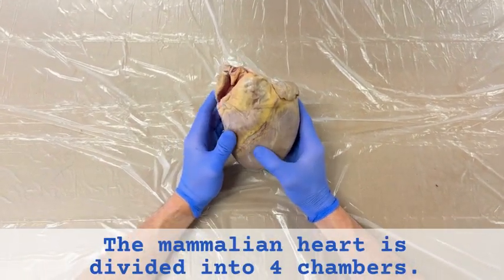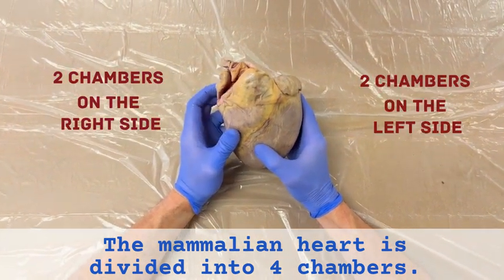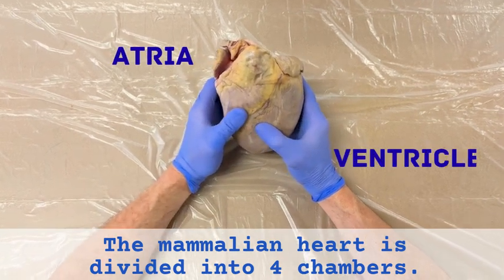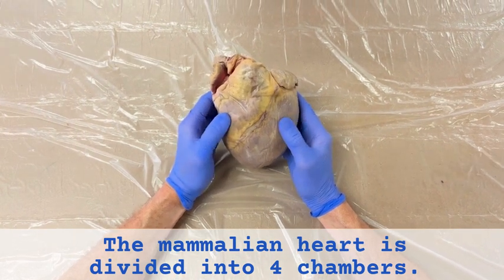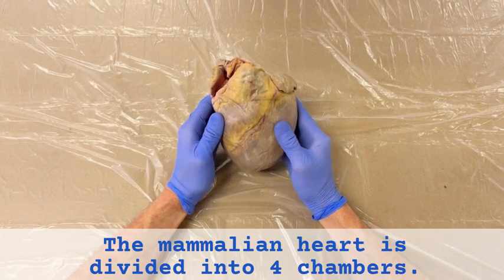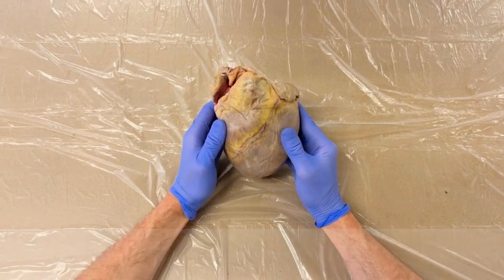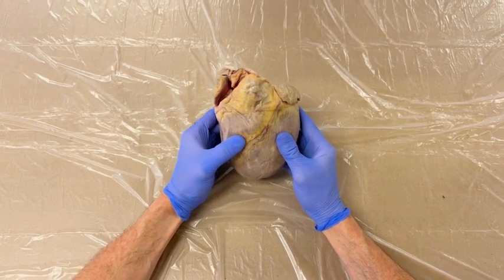The mammalian heart is divided into 4 chambers. There are 2 chambers on the right side, 2 chambers on the left side. The top chambers are called the atria, and the bottom chambers are called the ventricles. We're going to walk through each of these chambers as we dissect this pig heart. It's a little difficult to tell in looking at the external anatomy where these chambers are. So we're going to start with the top right chamber, the right atrium.